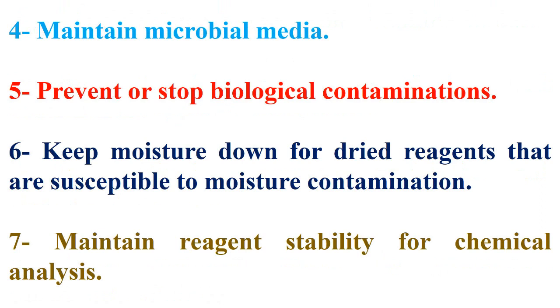5. Prevent or stop biological contaminations. 6. Keep moisture down for dried reagents that are susceptible to moisture contamination. 7. Maintain reagent stability for chemical analysis.